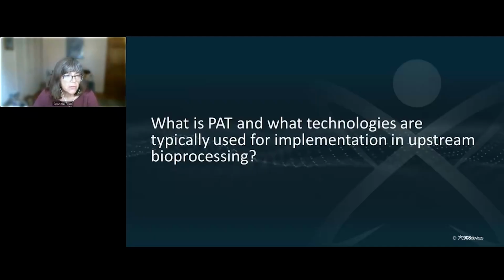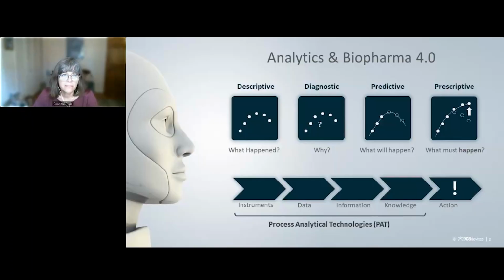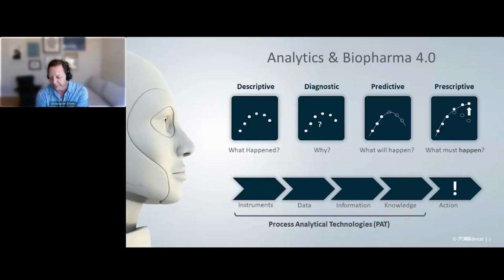Excellent. So Biopharma 4.0, process analytical technologies, and guidelines from the FDA said 20 years ago. Can you tell us a little bit more about all that? Yeah, absolutely. So in the grand scheme of biopharma and pharma 4.0, analytics is really a key part of that, and the use of advanced technologies to guide us toward reaching the biopharma 4.0 objective. In the context of analytics, people always talk about sort of 4 steps through that process and the tools to support those.